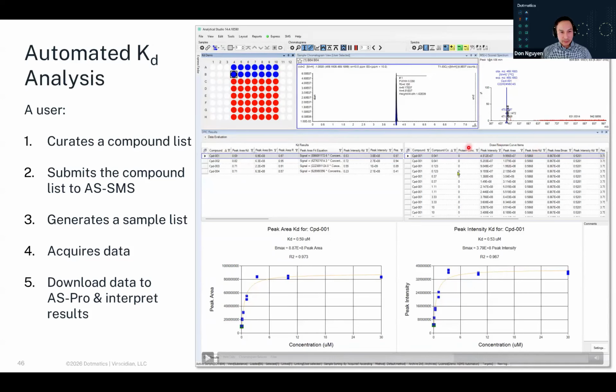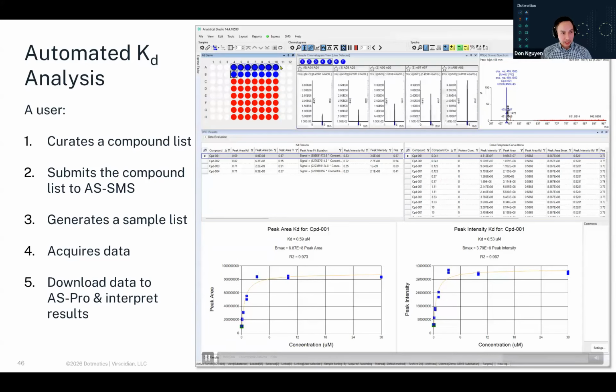Over here on the right half of this DRC panel are the individual injections that make up this particular series. So these are all the varying concentrations of our injection. If we go ahead and display multiple chromatograms at the same time, we can even see a binding curve start to appear based purely on a chromatographic visualization, right?